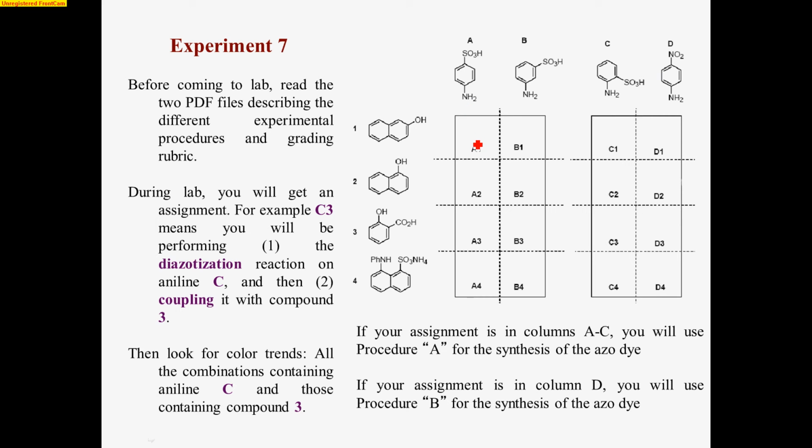What you're going to find is that these are the building blocks that you can use to form around that central diazo core. So if you have 4 building blocks on each side, and they all come together in that central diazo core, 4 times 4, the permutation is that you can get 16 possible molecules.